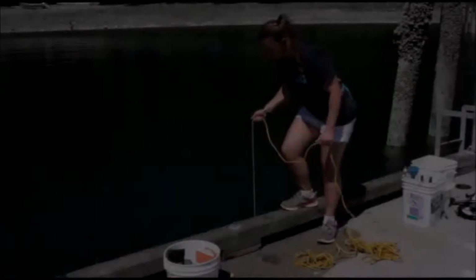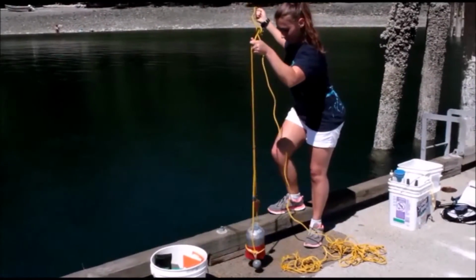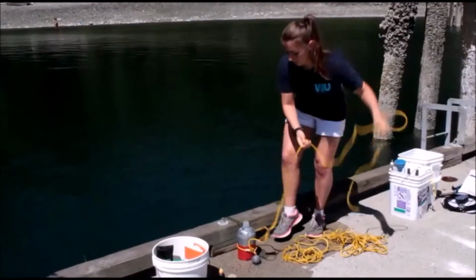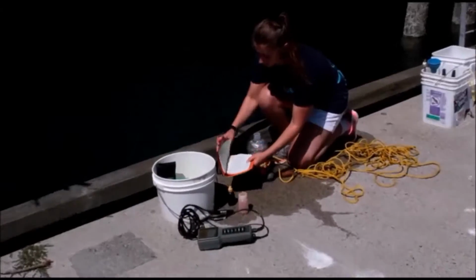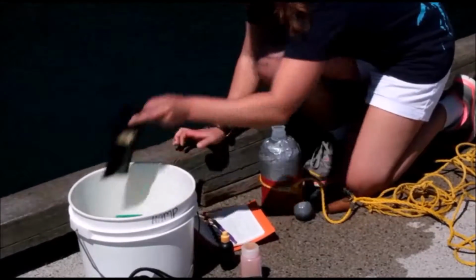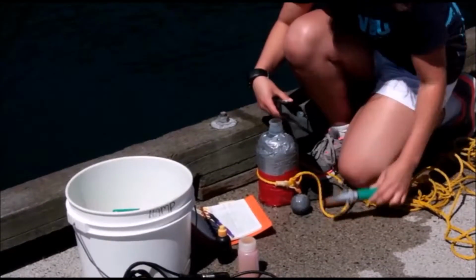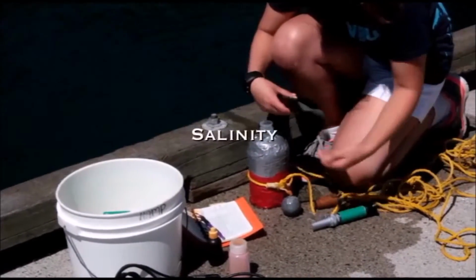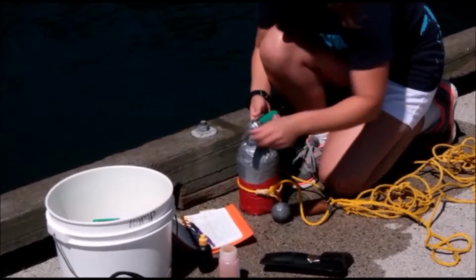Next, environmental monitoring, monitoring of water parameters. When taking plankton samples, it's a good idea to collect environmental data on water temperature, salinity, and dissolved oxygen at the same sampling depths. This can be done using the sample in the sample bottle or actually measuring right in the water column if you have a multimeter with a long cord.